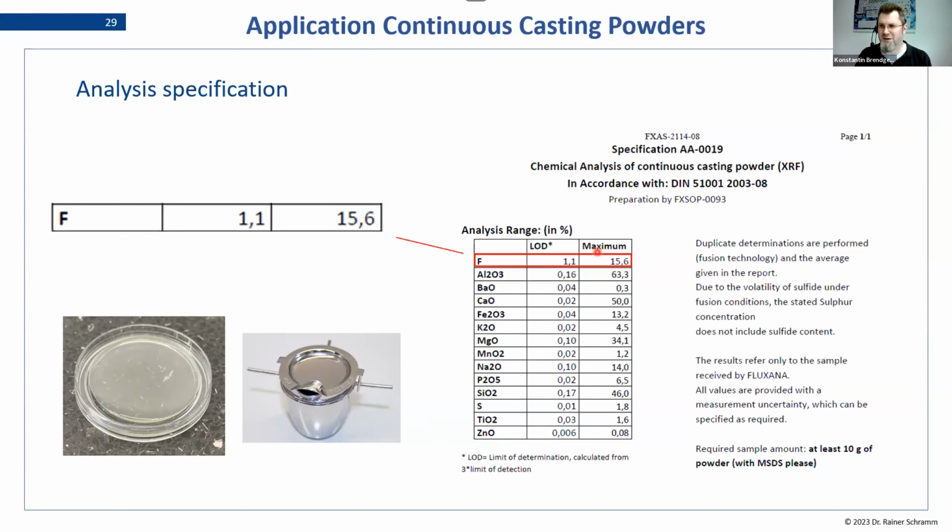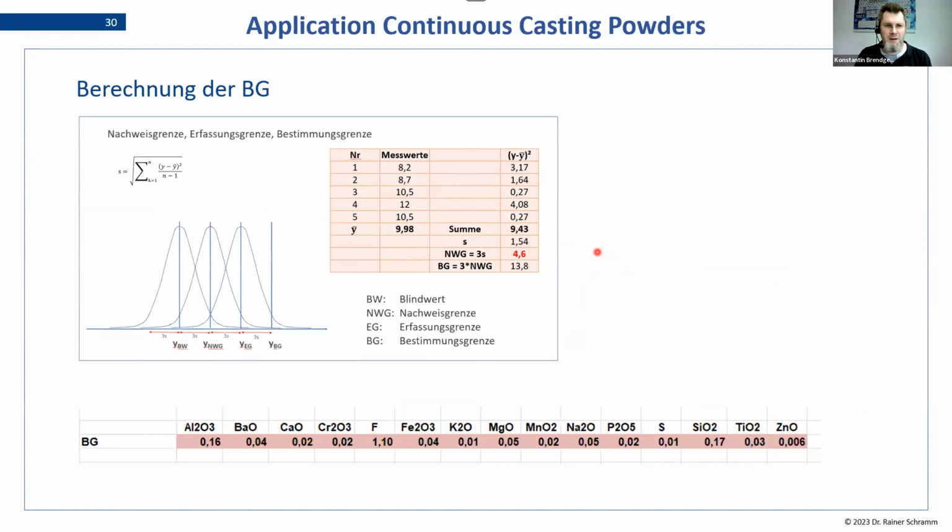So fusion is basically the only way to do it, but we have the problem that we cannot detect low concentrations of fluorine here. The way we do it is here. I'd actually like to skip over this because time is getting short. There are other webinars available and coming which will deal with this more statistical side of our analysis.